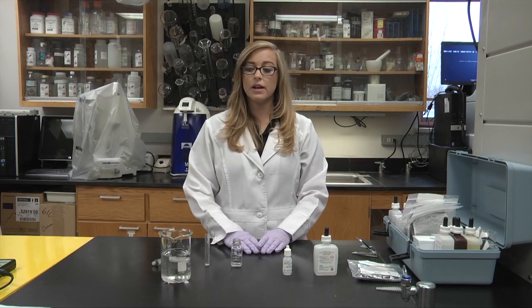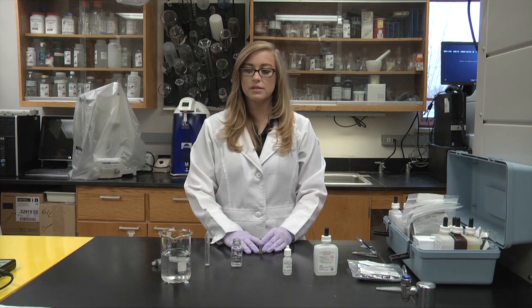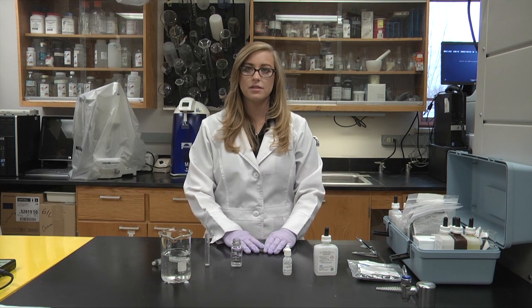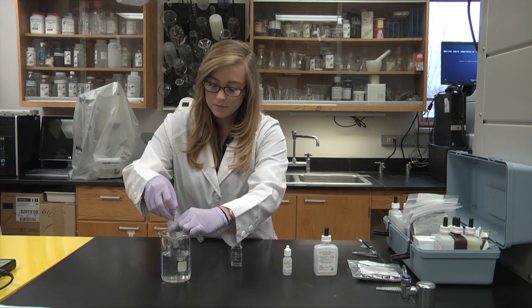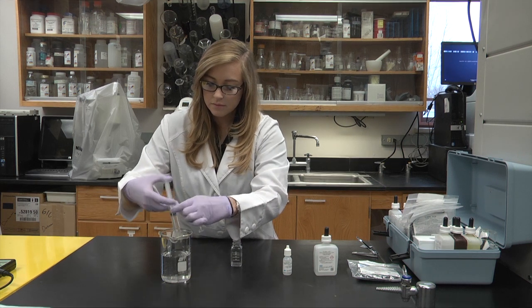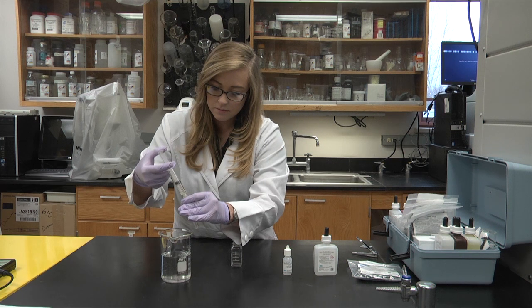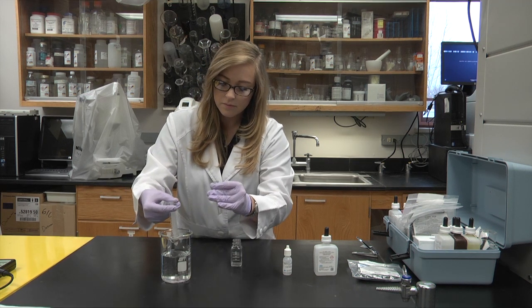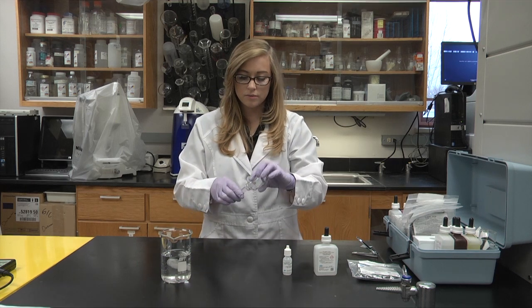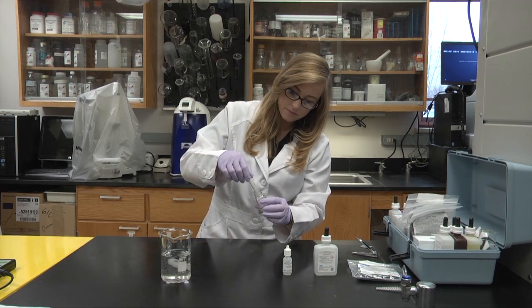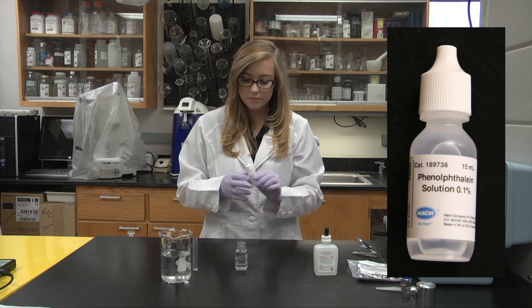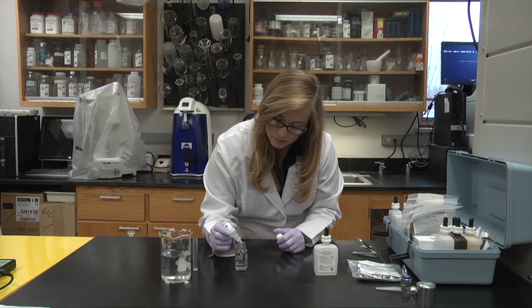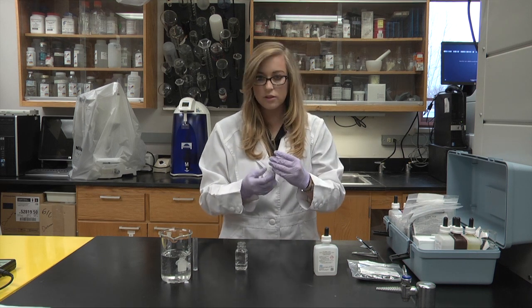Now we're going to test for alkalinity. Alkalinity is the total concentration of bases, and this refers to the capability of water to neutralize acid or its buffering capacity. So first you're going to get your plastic tube and fill it up, and then pour it into your glass mixing bottle. Then you add one drop of the phenolphthalein solution.